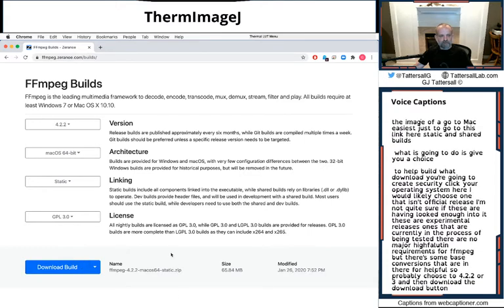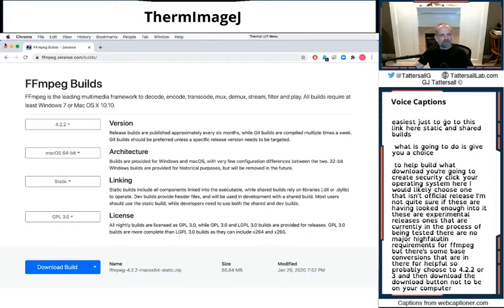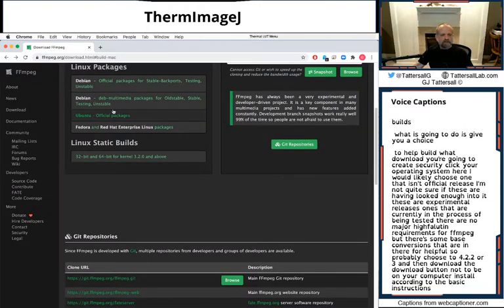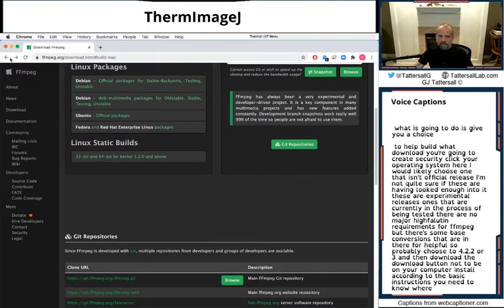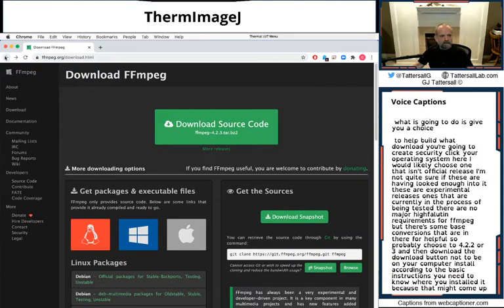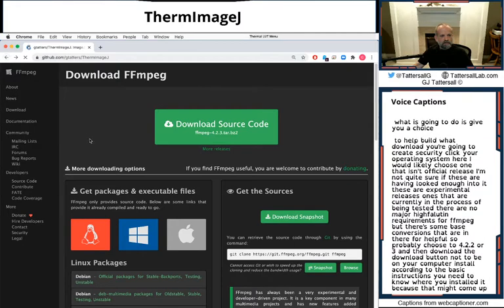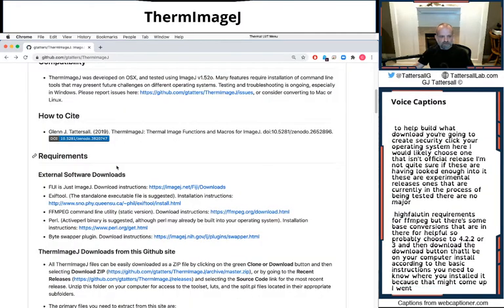That'll be on your computer. Install according to the basic instructions. You need to know where you installed it because that might come up when FFmpeg looks for it or when my macros look for it.